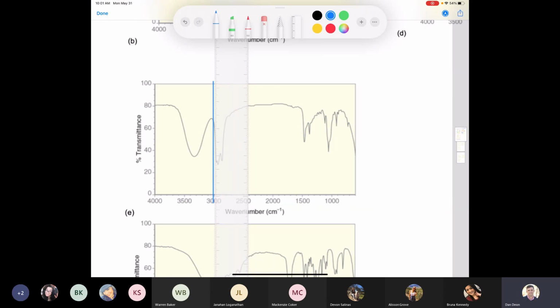Yeah, I think it looks like an alcohol, Jonathan. I agree. Between 3,200, so we'll draw a line around 3,200, which is around here, and then 3,650, which is around here. Either way, it's close, but we have a broad absorption here, so we'll put oxygen-hydrogen stretch. There's no carbonyl, so no carbonyl. And then we have this, which might be the carbon-oxygen stretch. And so this would be an alcohol.